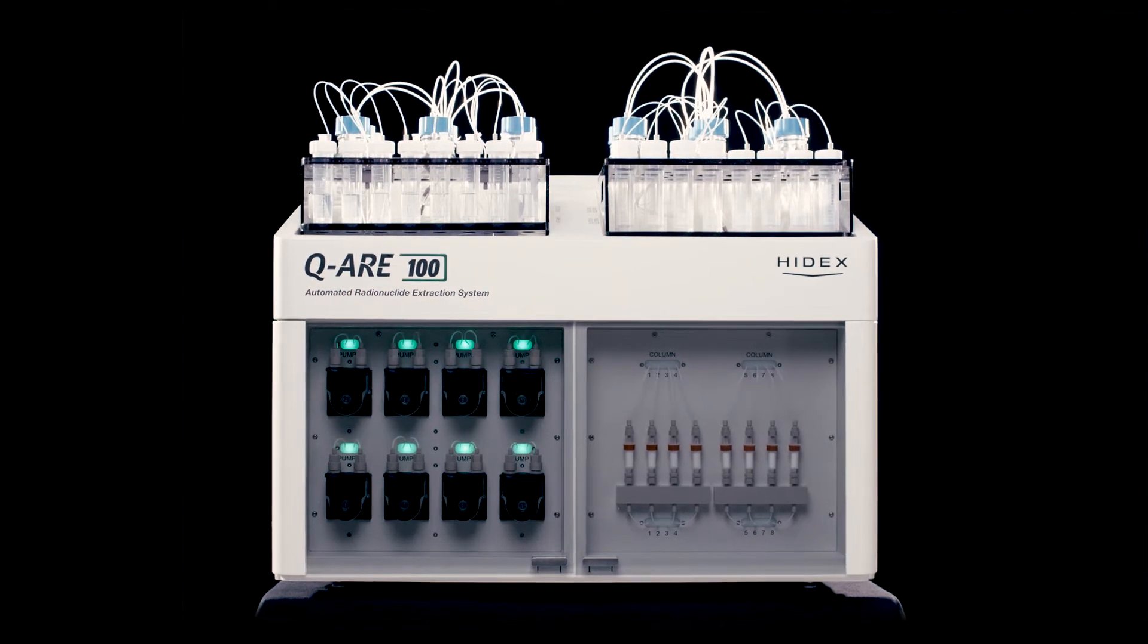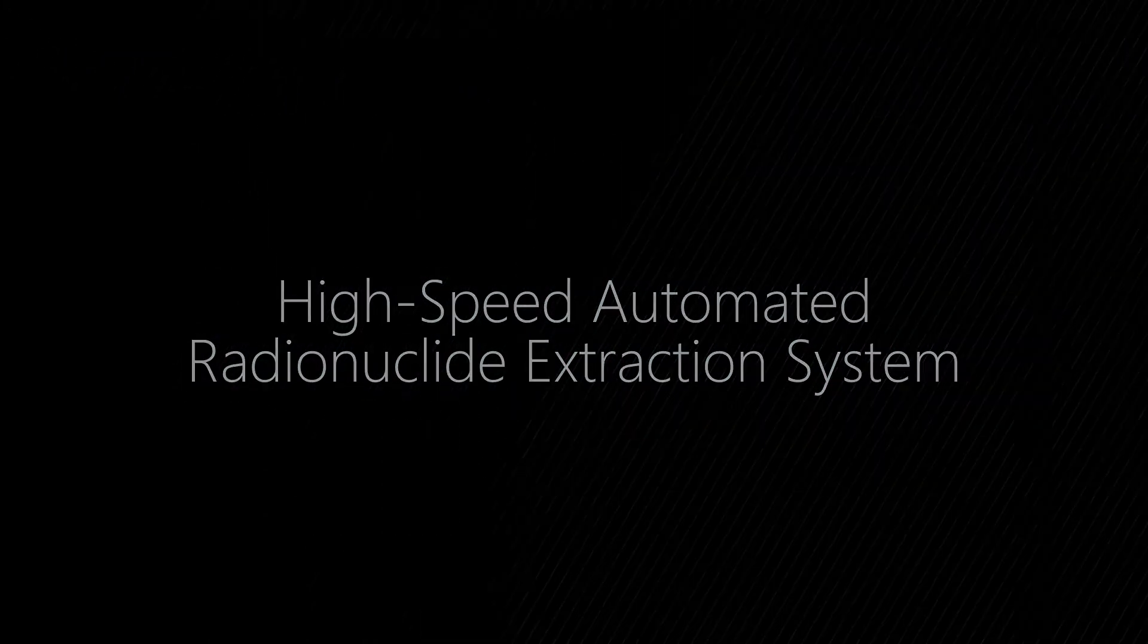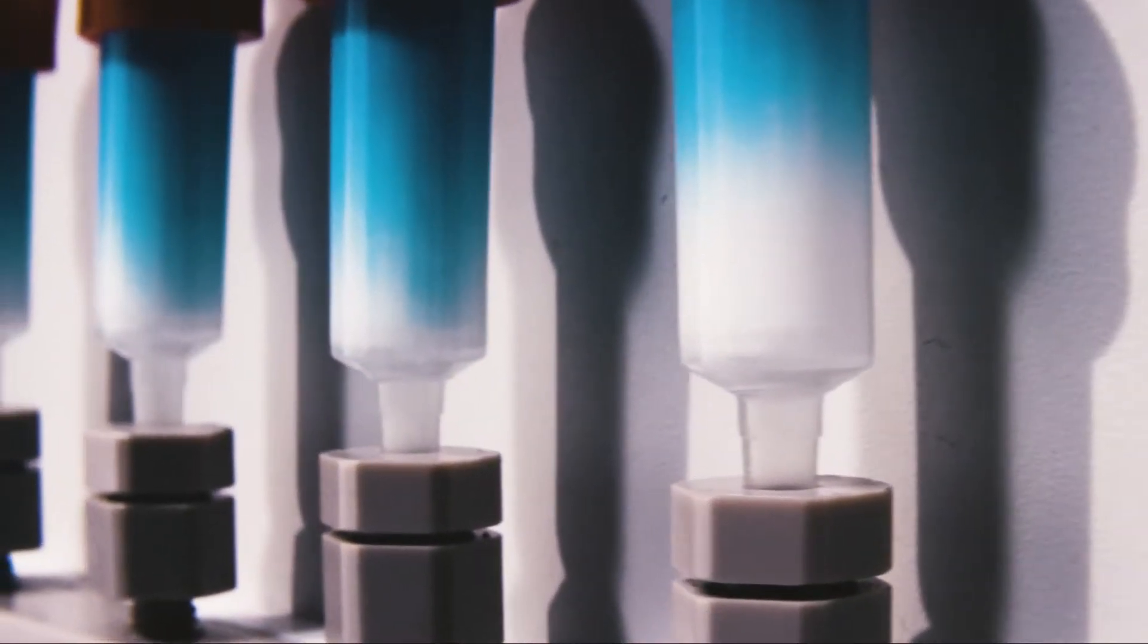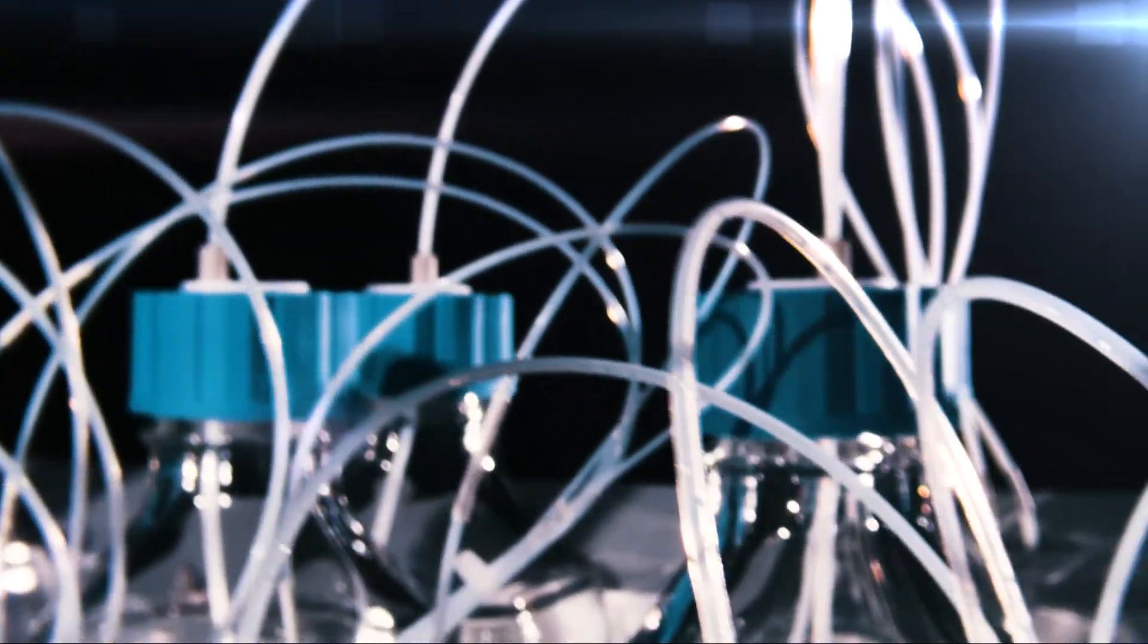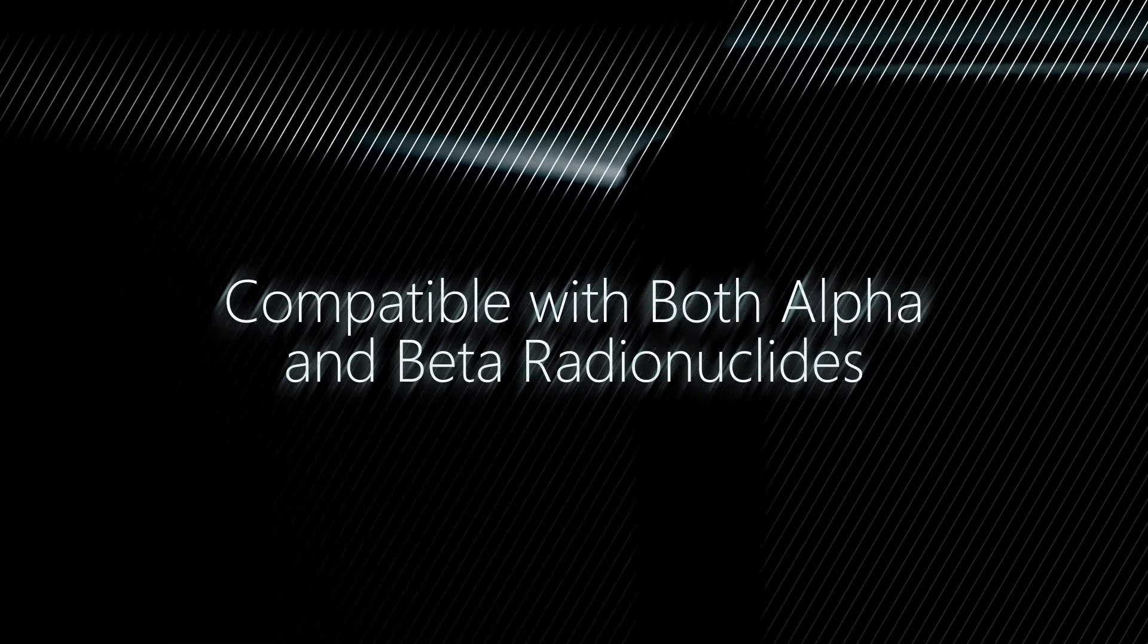A high-speed automated radionuclide extraction system for demanding and time-conscious research. Works with commercial pre-packaged iChrome and Triscum extraction chromatography columns. Compatible with both alpha and beta radionuclides.